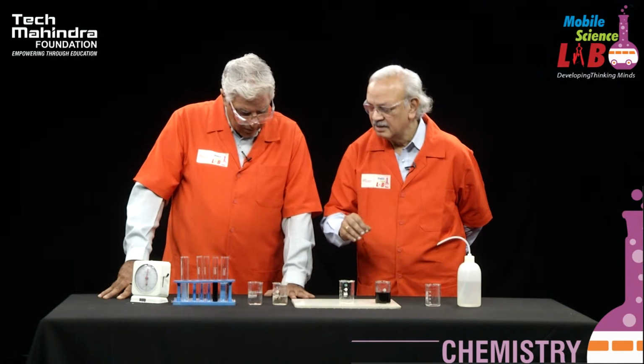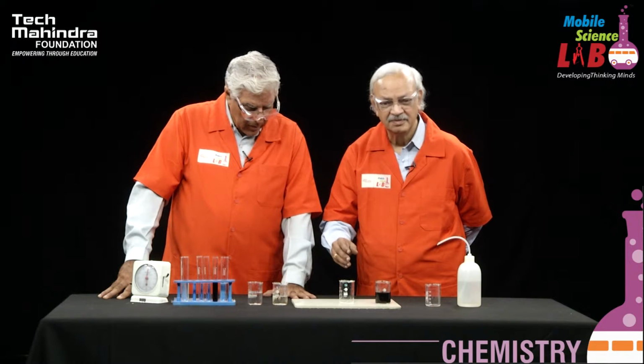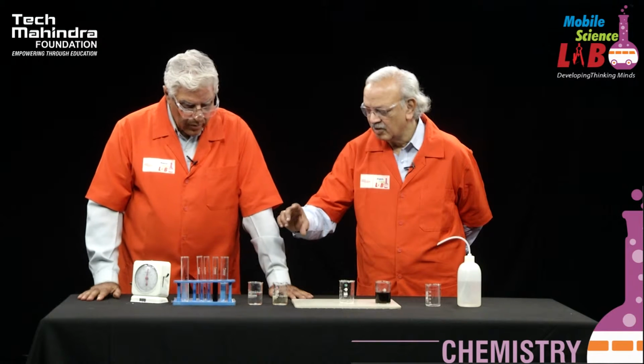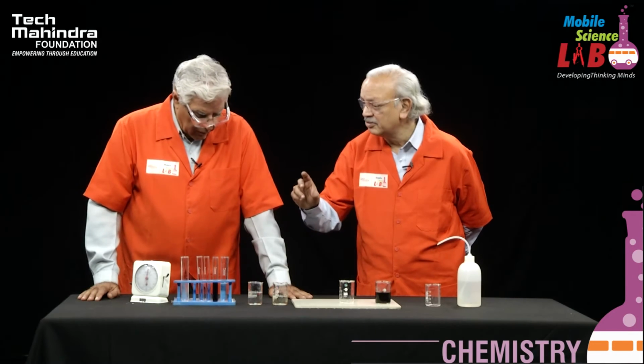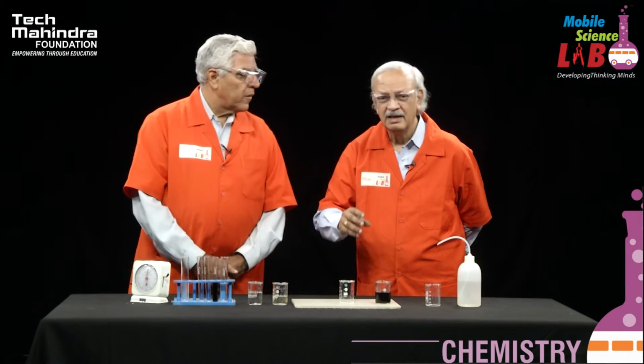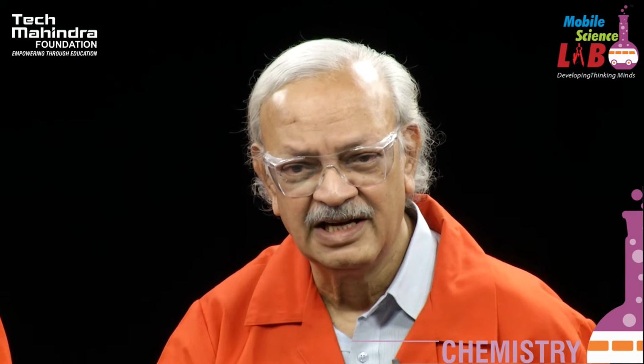Number three is effect of concentration. One simple variation can be, you have taken almost half test tube of potassium iodide. So in the next experiment, take 1/4 of potassium iodide and add 1/4 water. Total volume is the same, but the concentration is half of it. That's right. So you will see some interesting results. Concentration enhances the rate of reaction.